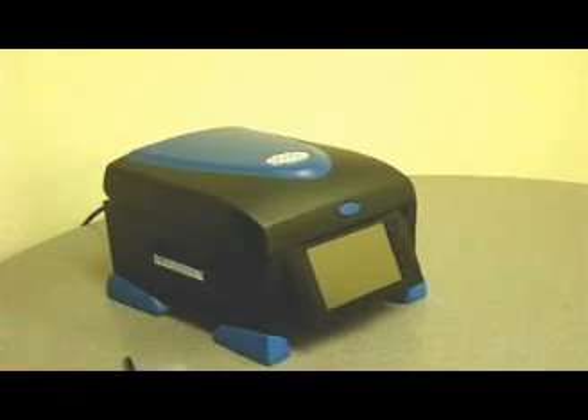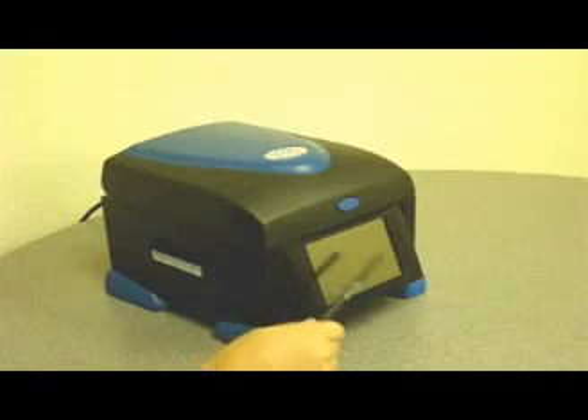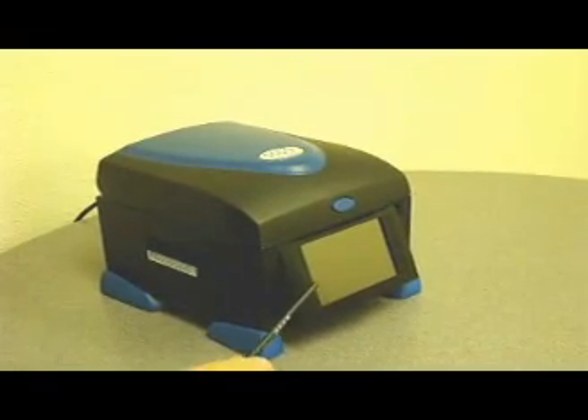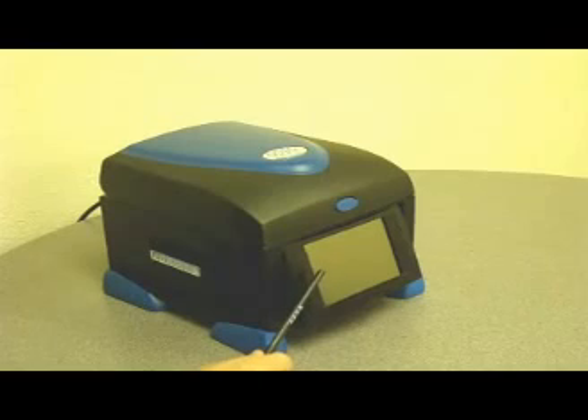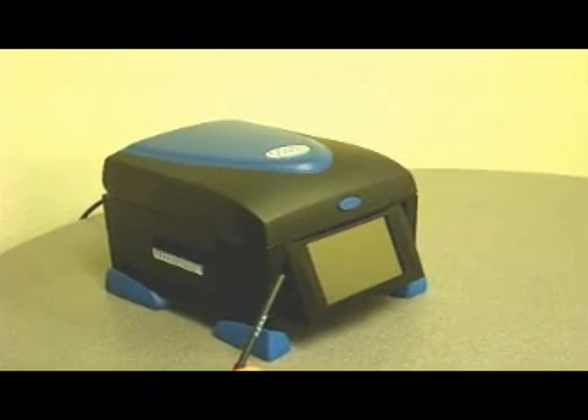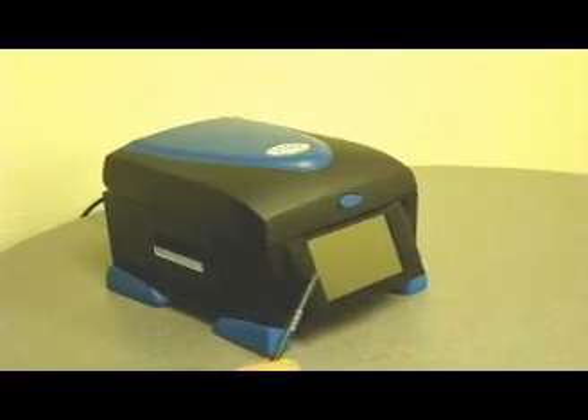No more guesswork. The heart of the control system on the Amplitronics brand thermal cyclers is the 5.7 inch touch screen. The A4 features this in black and white, and the A6 advanced unit is in full color.